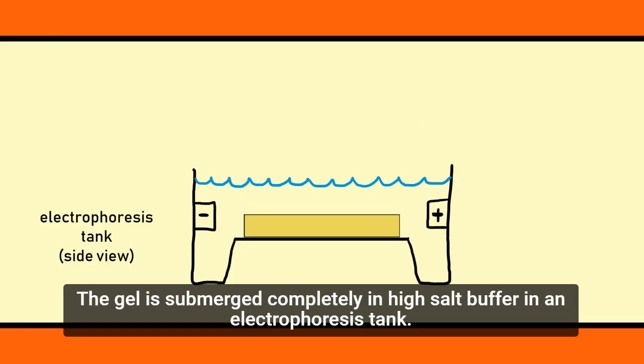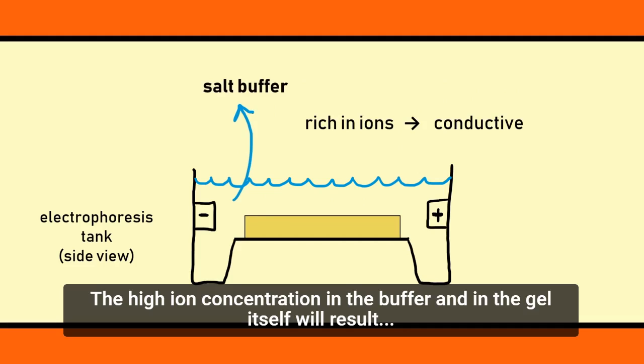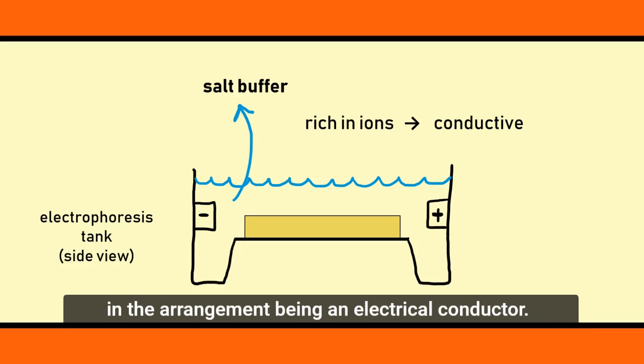The gel is submerged completely in high salt buffer in an electrophoresis tank. The high ion concentration in the buffer and in the gel itself will result in the arrangement being an electrical conductor.